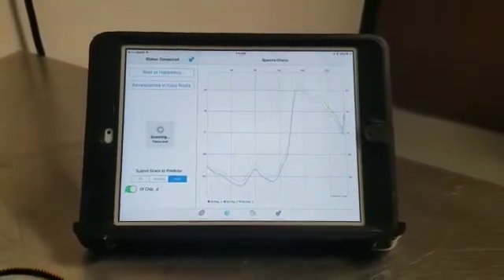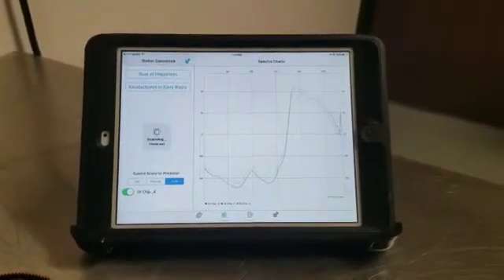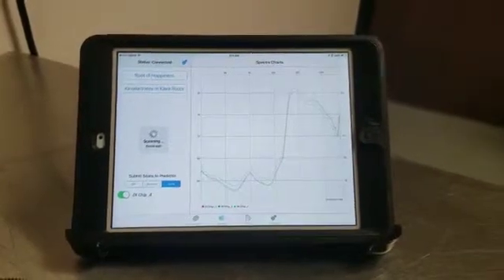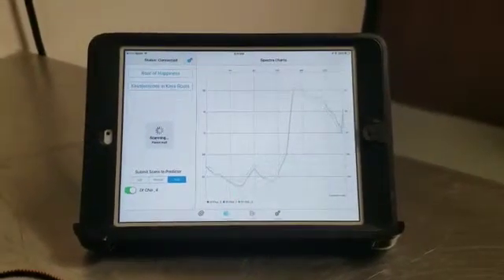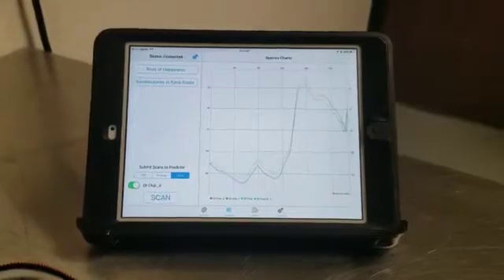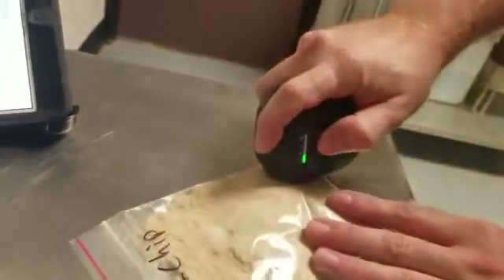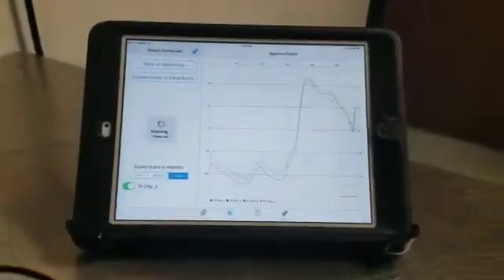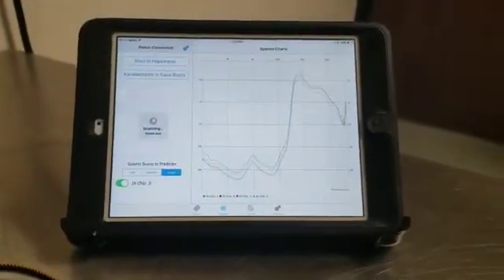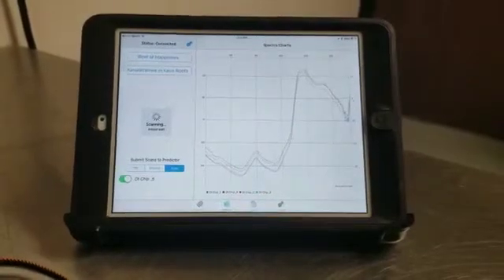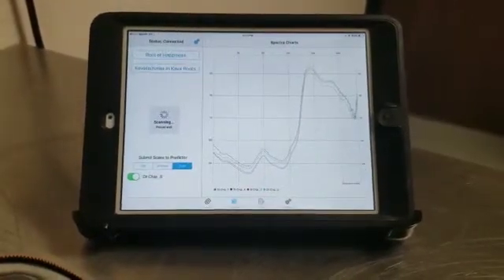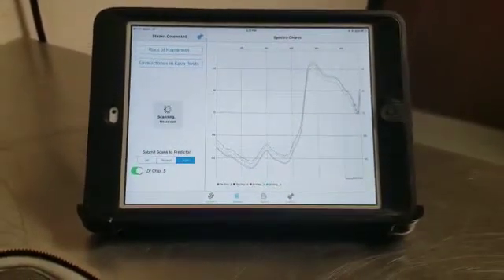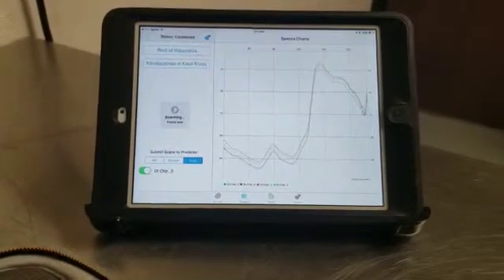And we're going to do this five times across the bag, so that we get a good spectrum of different scans off this bag. Make sure all the material is actually being tested. And what the system does is it averages these scans and computes it in the cloud, and will give us a result instantaneously. So, we're on our fourth scan. We're going to give it one more.